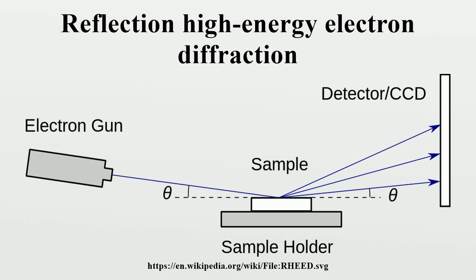These detectors emit green light from areas where electrons hit their surface and are common to TEM as well. The detector screen is useful for aligning the pattern to an optimal position and intensity. CCD cameras capture the patterns to allow for digital analysis.